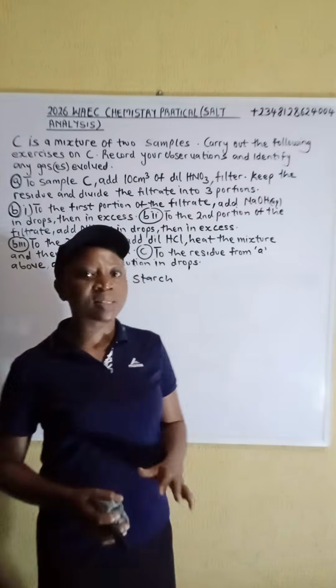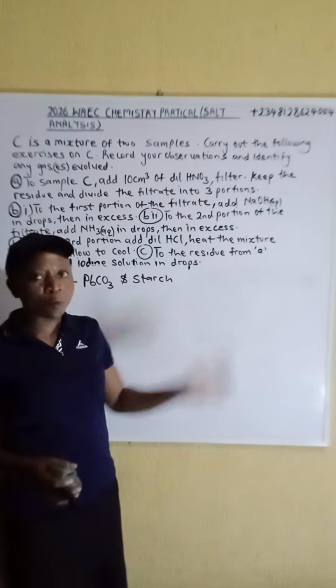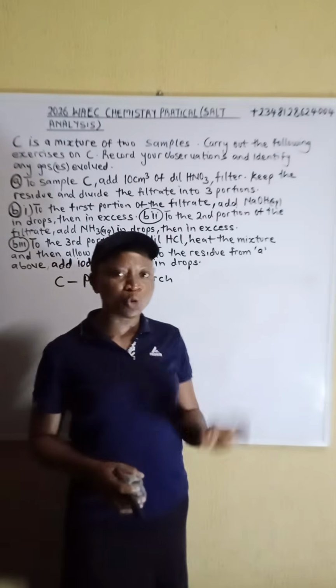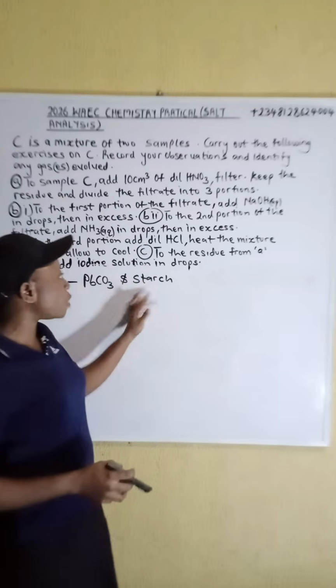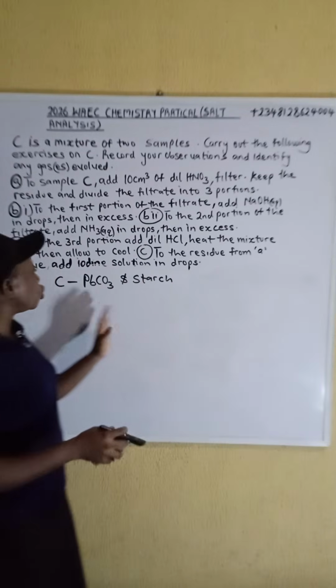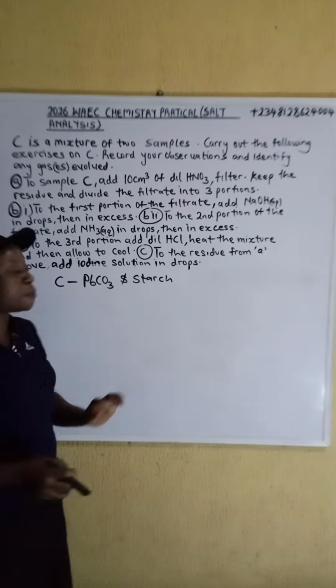So we are going to look at the state of the two samples. We are going to talk about their solubility. Then we look at the possible chemical tests on the two samples. So let's talk about the solubility of the two samples.